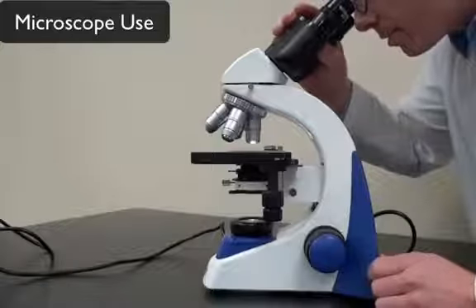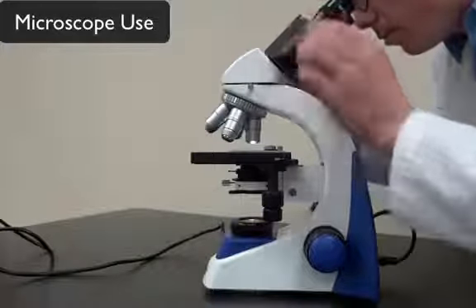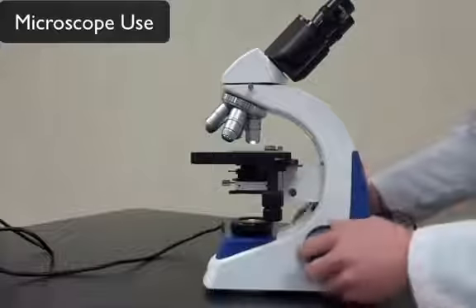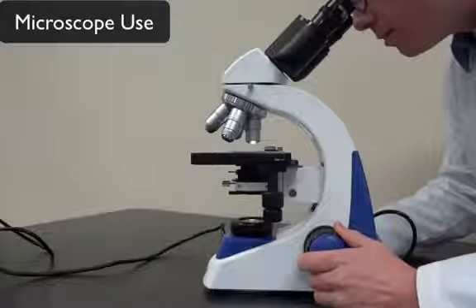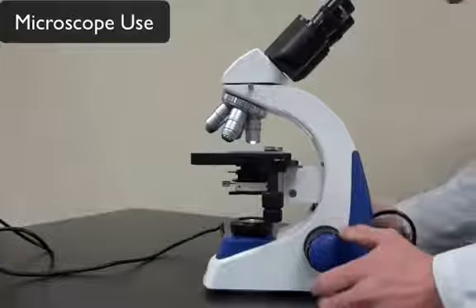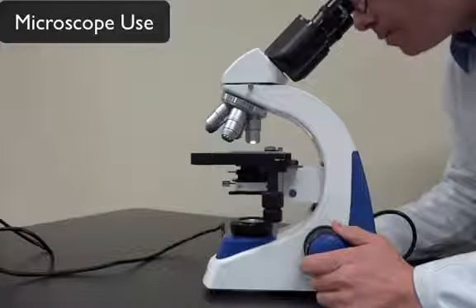So once we're here and the stage is all the way up, you're going to peer into the ocular lenses, and you may have to adjust them so you can get it to one view with both eyes. Now there's only one direction to take the slide stage, and that's down. Okay, so you're going to view in, and you're going to slowly, using the coarse adjustment, lower the stage slide down. And what you'll see is the specimen on the slide will come into focus.